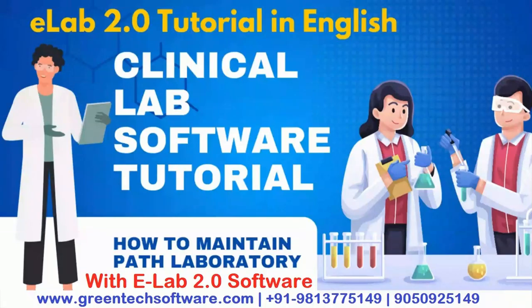Friends, in today's lecture, we'll discuss the next software, that is eLab software. This software is a laboratory software in which you can manage the records of patients. You can print accurate reports of the patient. You can add the doctor's commission and doctor's details. If you want to add the test formulation, you can add that also.